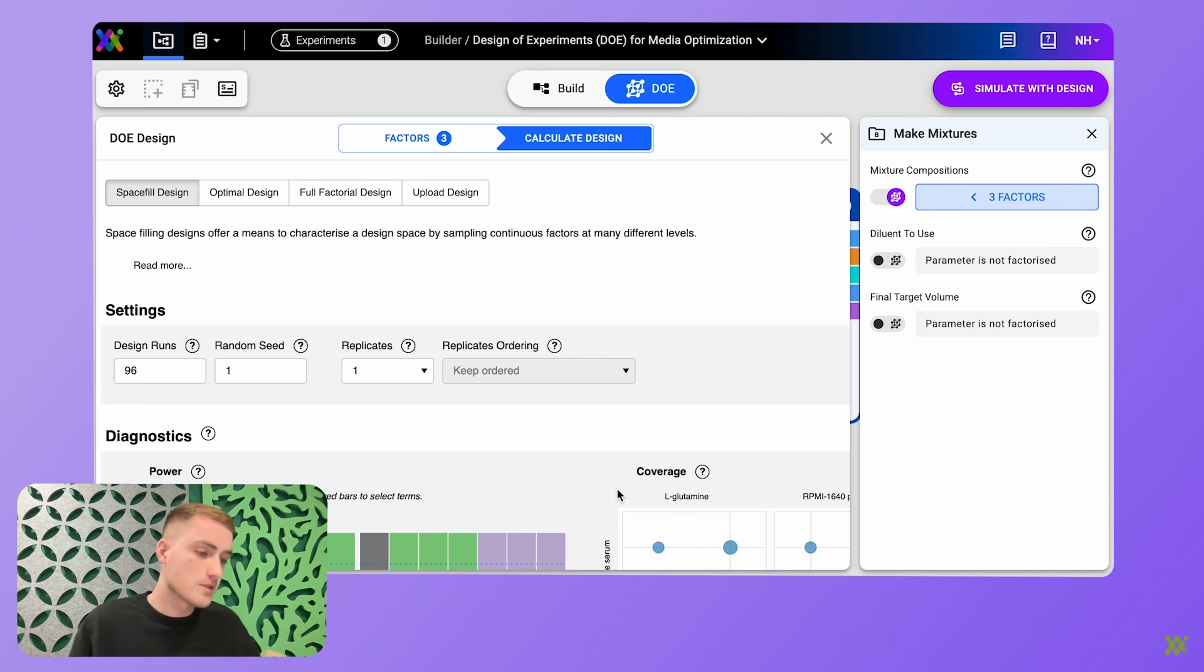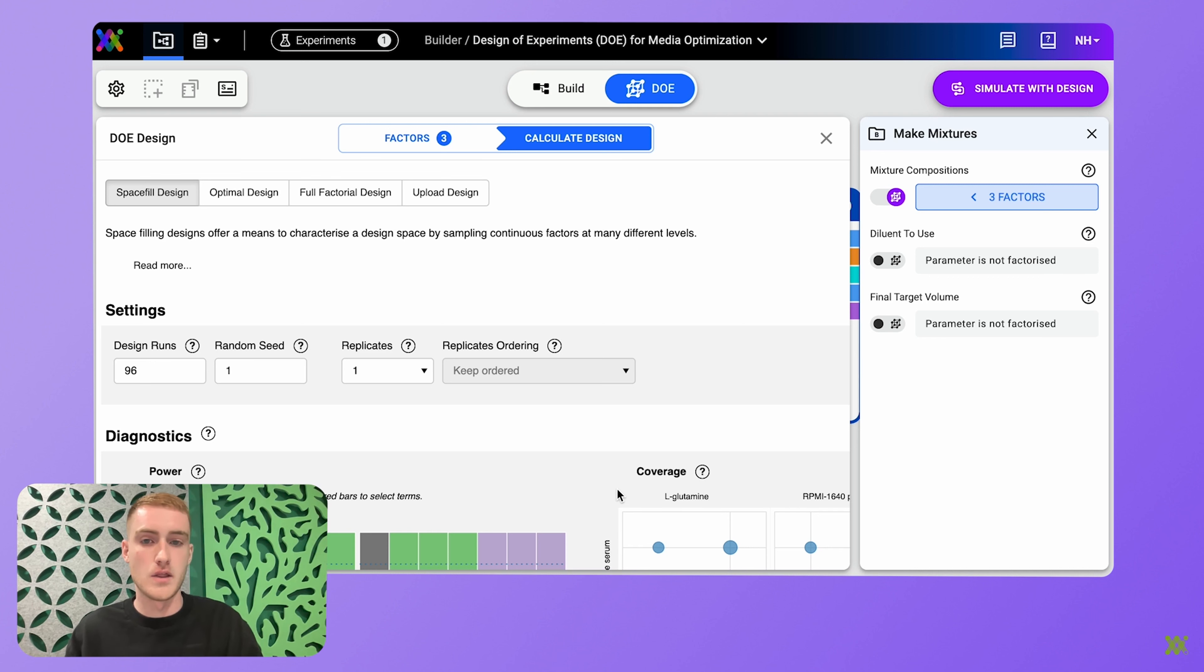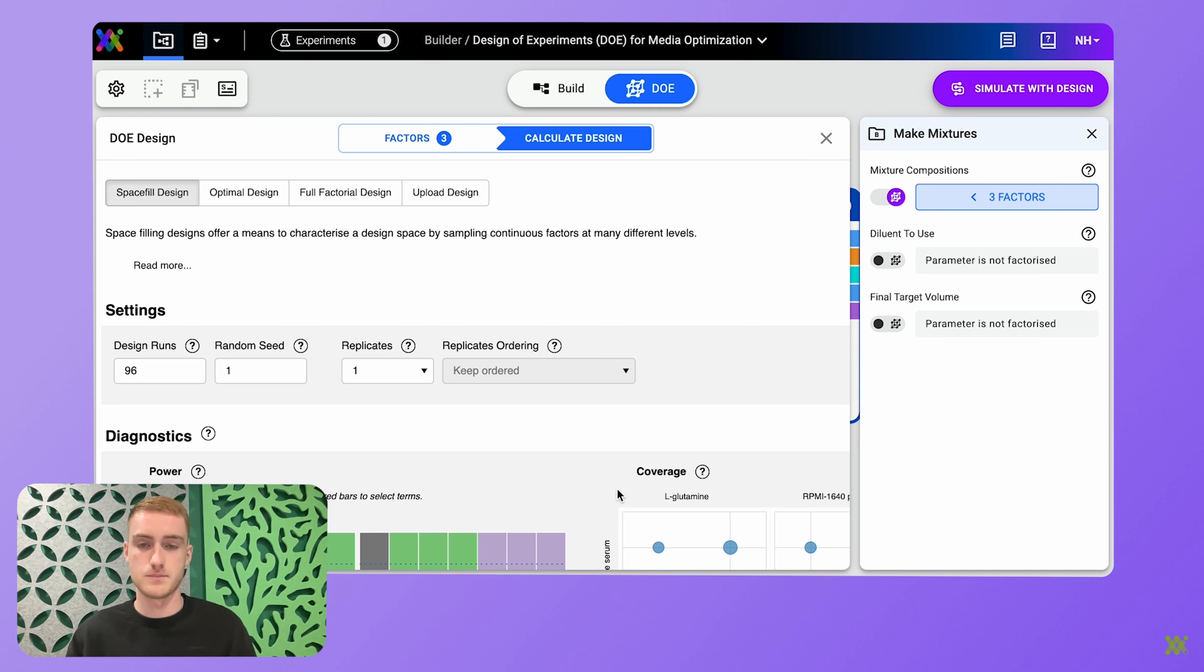Now, of course, if you are a DOE expert or just prefer to use your own software to generate the design, you can upload that in a CSV file format using the upload design button.